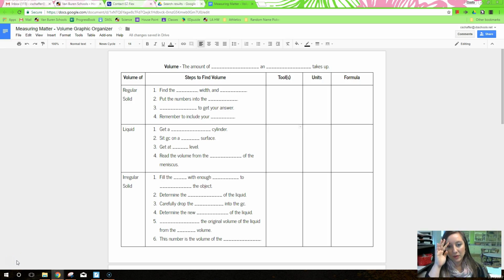Hi, sixth grade. This video is going to be all about finding the volume of a liquid. And really it's going to be nice and short because you've done a lot of the difficult work in figuring out how to use a graduated cylinder first. Now really we just have to put the liquid into the graduated cylinder and use the information that we've already had from our last video to get our answer.